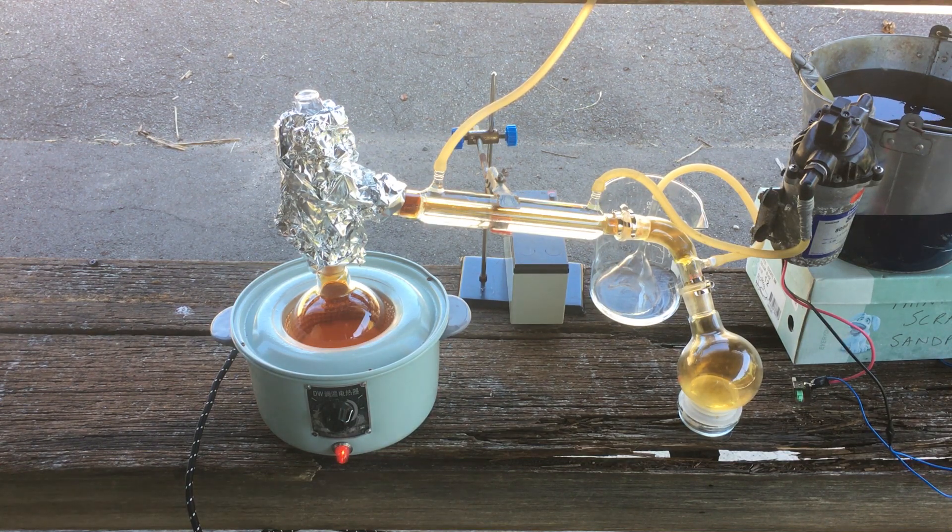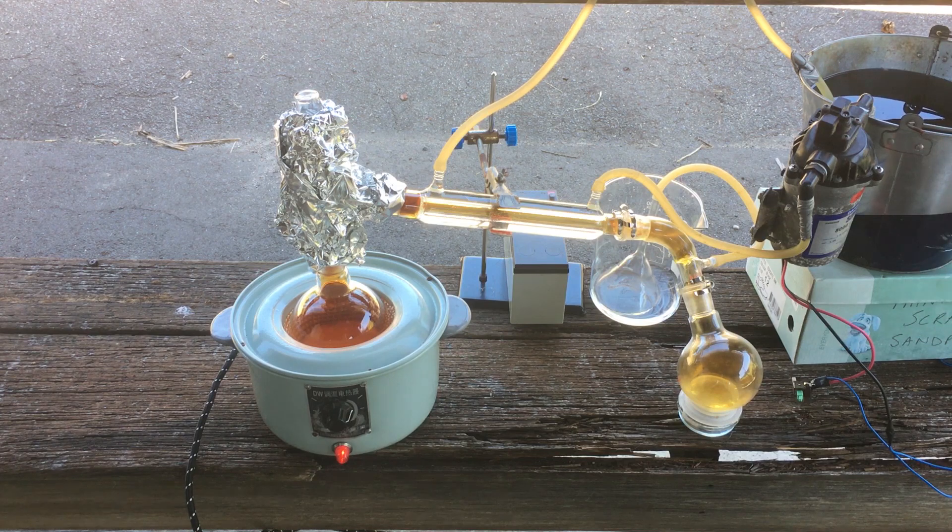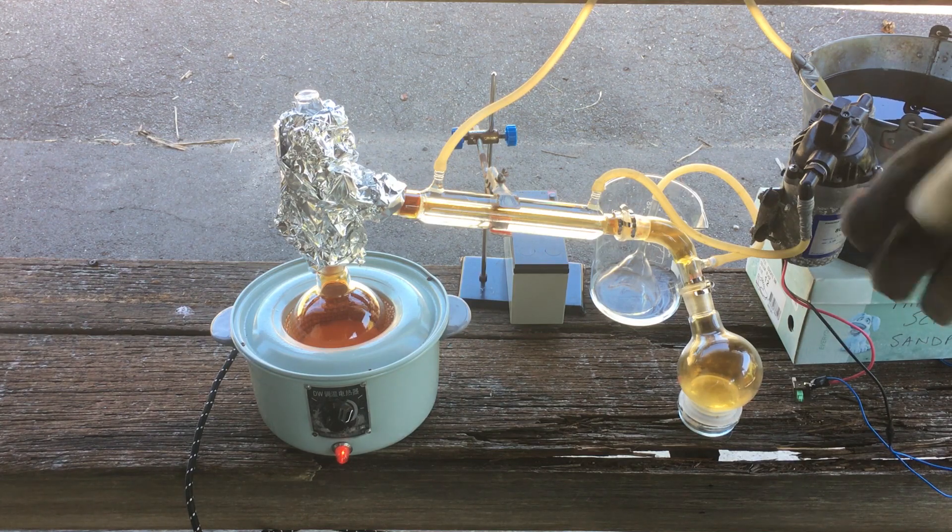Another thing you've probably noticed by now — seeing as we have actually generated a bunch of nitric acid — this isn't just azeotropic nitric acid, this is red fuming nitric acid, so that's pretty close to 100% nitric acid.